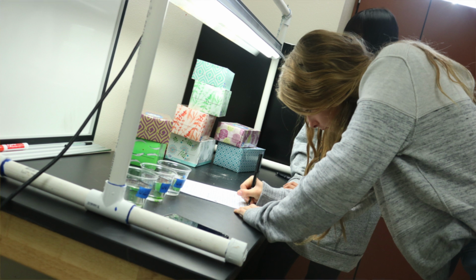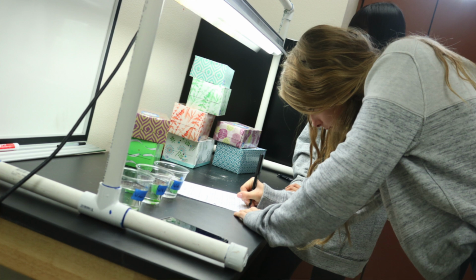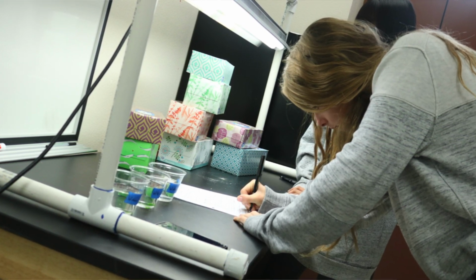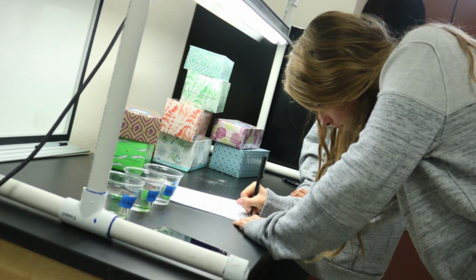So my students will spend several days in the lab investigating the influence of their chosen independent variable on photosynthetic rate. And of course, they're going to be using my input and advice whenever they ask for it. I will give them whatever words of wisdom I can give them on how to best design their experiment. But I don't just spoon feed the game plan to them. I have them develop the game plan for themselves or amongst themselves, because it's a group of 3 or 4 in a lab group.